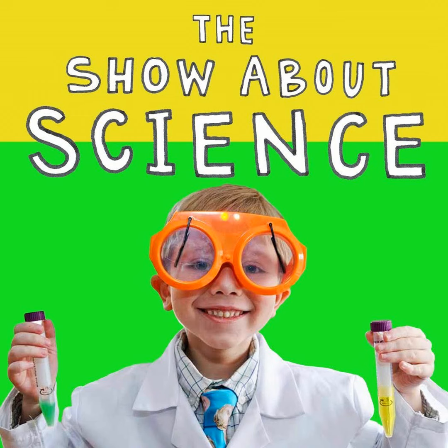All right, so come on in. So this is an organic chemistry lab. I was so excited to finally be in the lab and to learn all about the instruments they use to conduct experiments. Up first were the rotovaps. These are some of the coolest pieces of equipment that we own. These are called rotovaps, and this guy's name is Eddie.